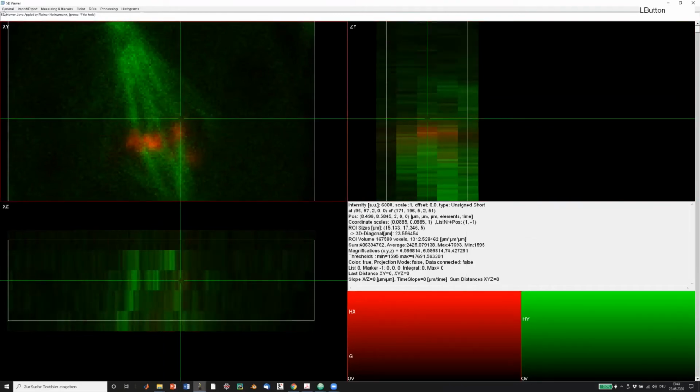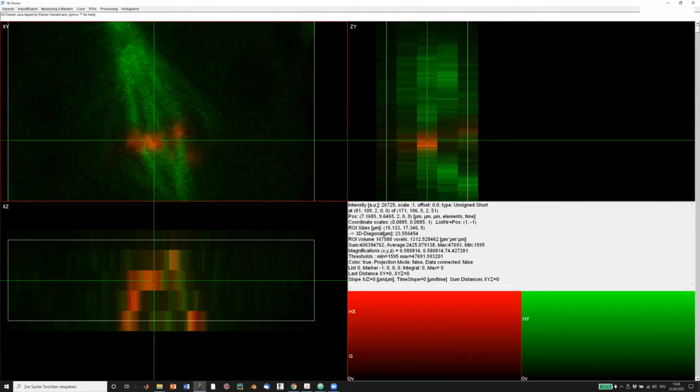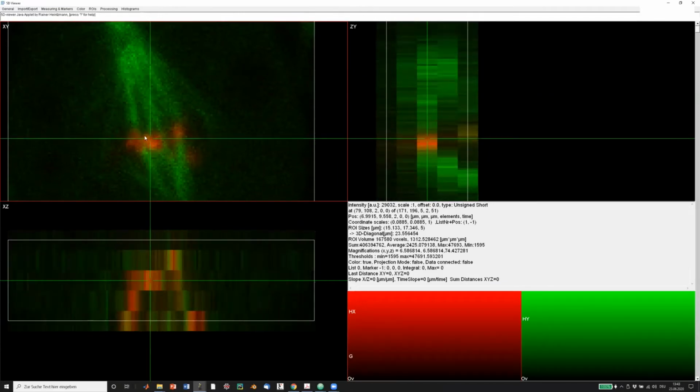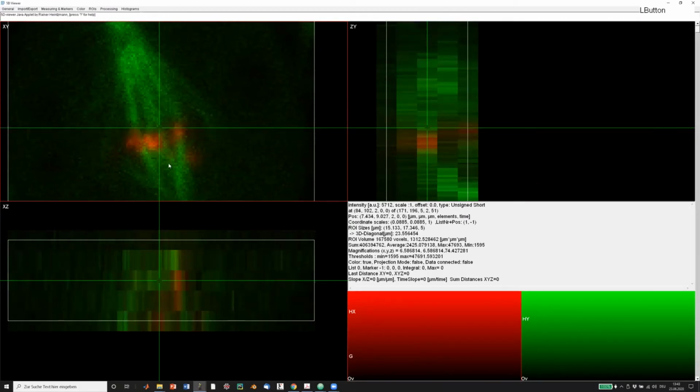And finally, in ImageJ, you see that a lot of the menu stuff is put on the top here. In some other working environments, like for example MATLAB or Python, you will find these menus integrated into the main context menu in the main view panel. So you can play around with these menu points and try to remember the different hotkeys to press, because they're always written behind the menu.